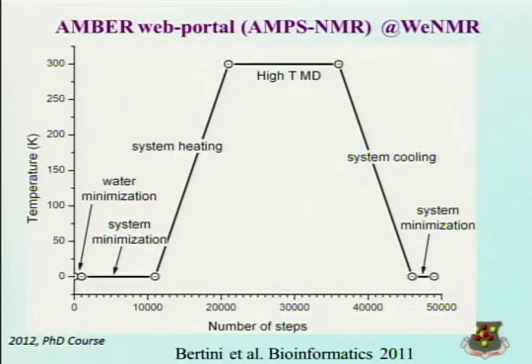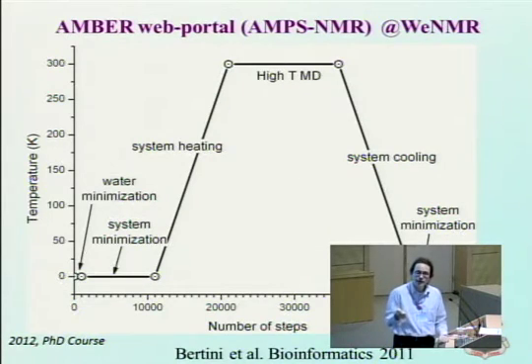Within the WeNMR platform, we developed a portal, as Alexander mentioned yesterday, for doing this kind of refinement, which is carried out in explicit solvent.